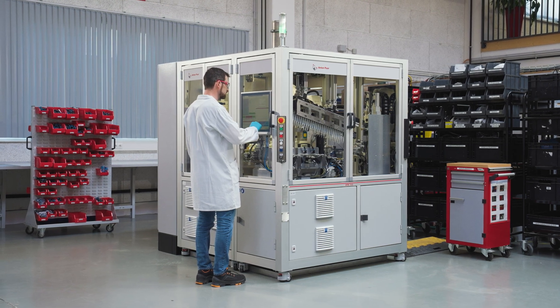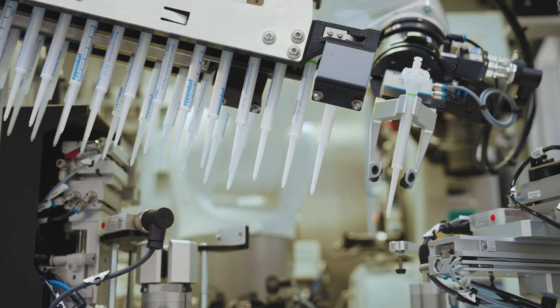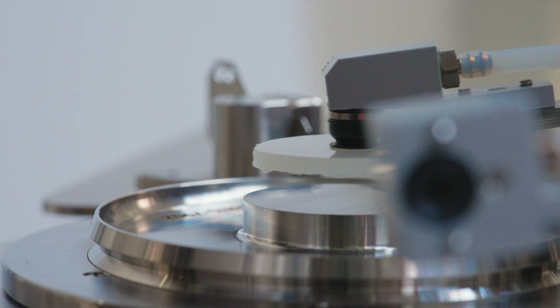Introducing the new HTR7000, Anton Parr's next-generation modular automated rheometer platform for liquid, paste-like or solid samples.